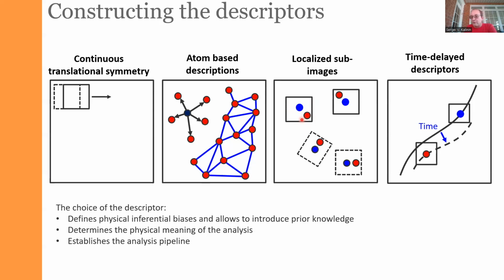And then it turns out that we can do even more interesting things. Very often we deal with image data taken as a function of time, in other words, videos. And very often these videos are detailed enough that we can trace the evolution of the object from one image frame to another. This is not always possible. For example, if I look at the evolution of graphene in the electron microscope, most of the time I cannot differentiate two different carbon atoms. Most of the time I cannot say that it is particularly this atom that jumped into that position.